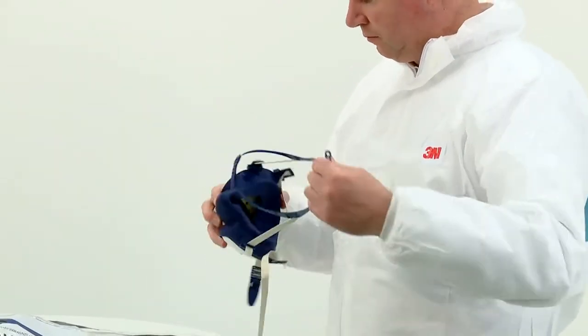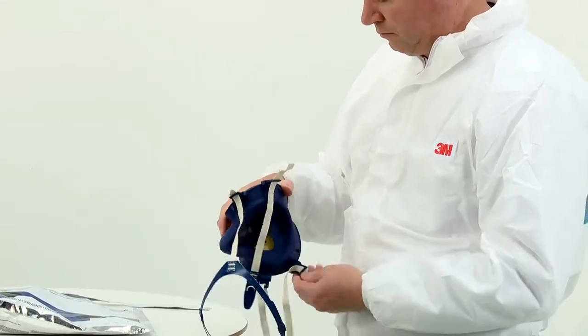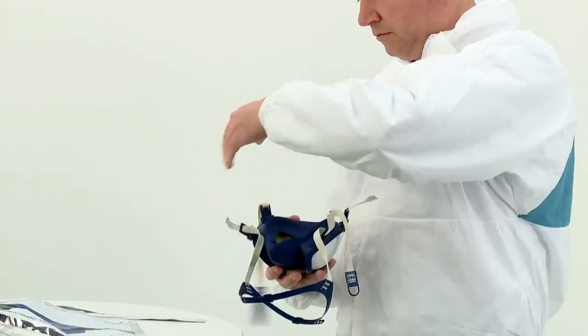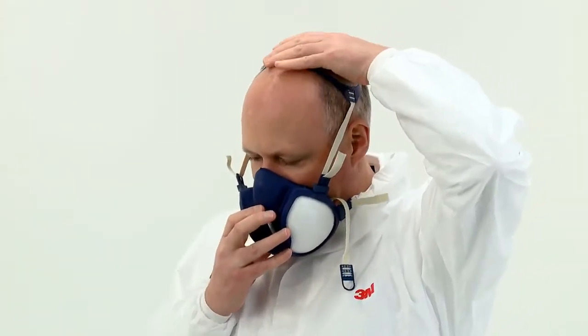Adjust the head cradle if necessary. To fit, place the respirator over your nose and mouth, fitting it comfortably on the bridge of your nose. Then pull the head harness over the crown of your head. If it feels uncomfortable, remove the respirator and adjust the size of the harness before refitting it to your face.